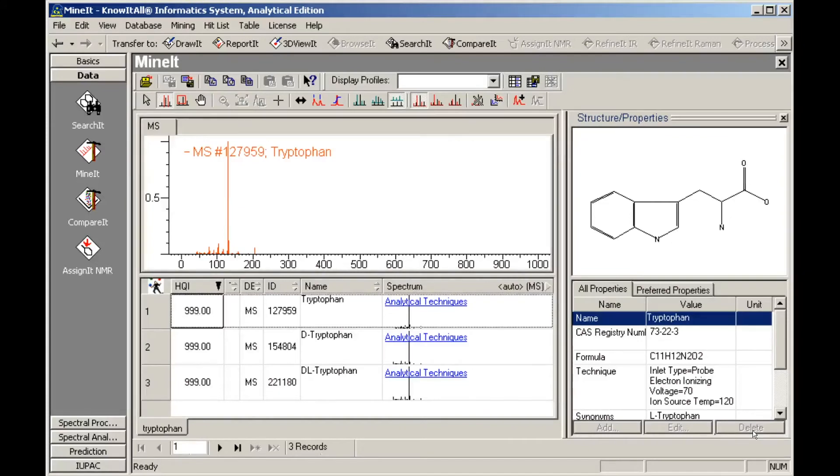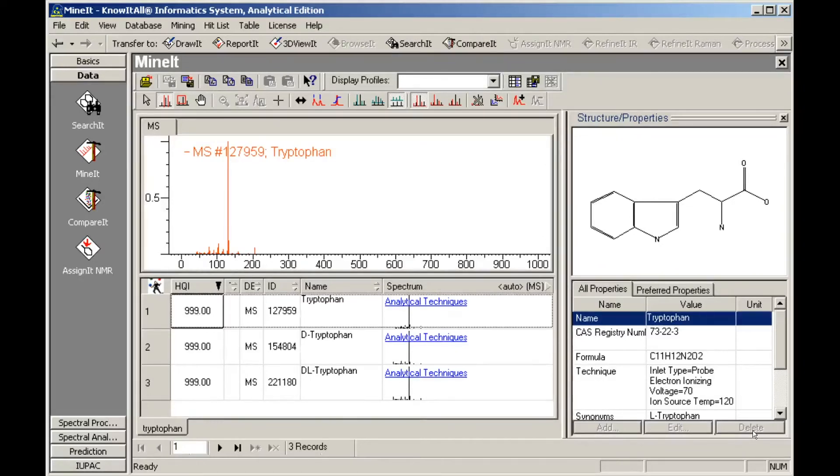The results are automatically displayed in the Minet application as a hit list. The Analytical Techniques hyperlink in the Spectrum column gives access to other database records for this structure. Click it to open the Analytical Techniques pane.